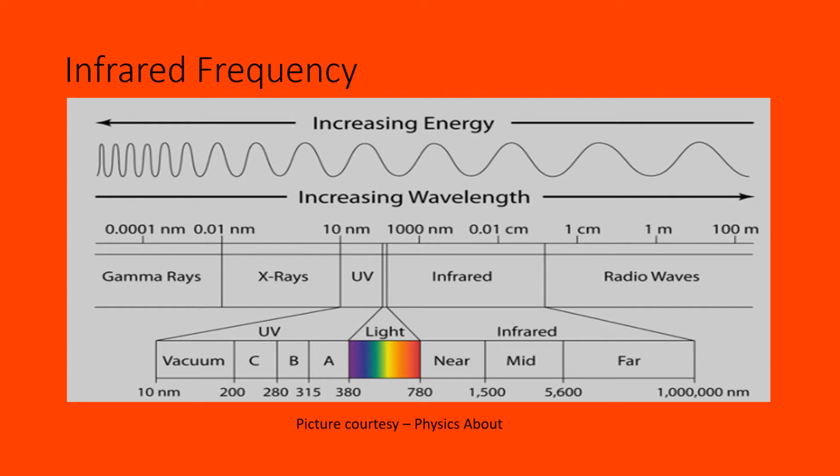In this infrared range, the electromagnetic energy will only be able to vibrate the atoms of the molecule in radial, symmetric and asymmetric stretching, latitudinal, that is scissoring and rocking, and longitudinal, wagging and twisting directions.